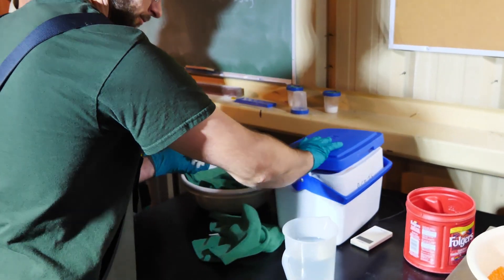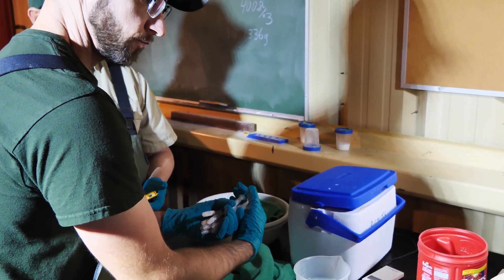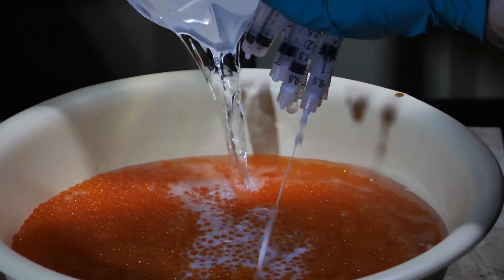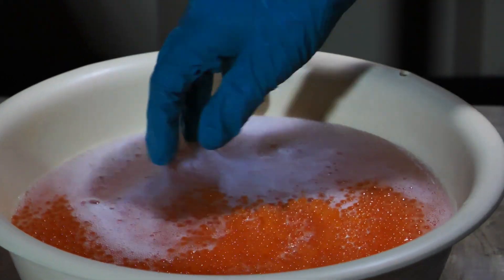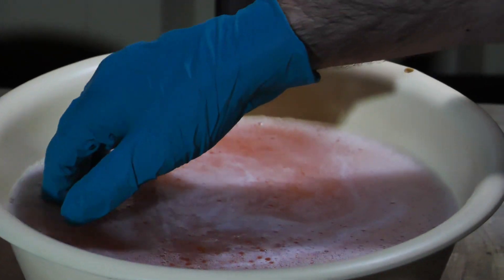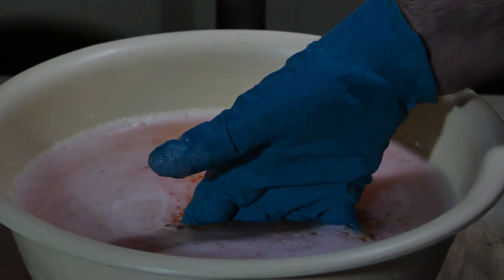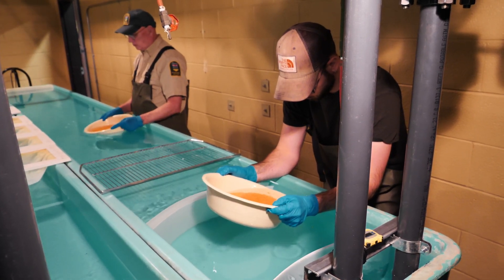At the triploidizing area, as soon as the fertilization process begins, time is critical. Time zero of the entire effort begins at the first lot's fertilization, and lots are fertilized 10 minutes apart. 1,300 grams of eggs are mixed with 6 to 8 syringes of milt and a milt activation solution is added. The eggs and milt are mixed and let stand for 2 minutes. Fertilized eggs are then washed of impurities to ensure the lot is as clean and pure as possible.